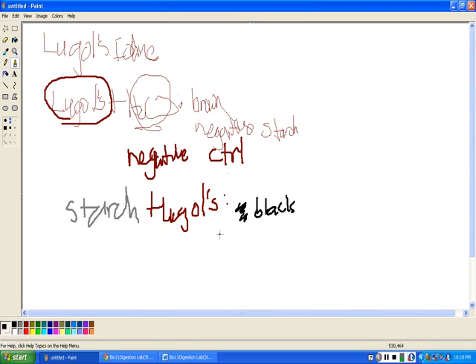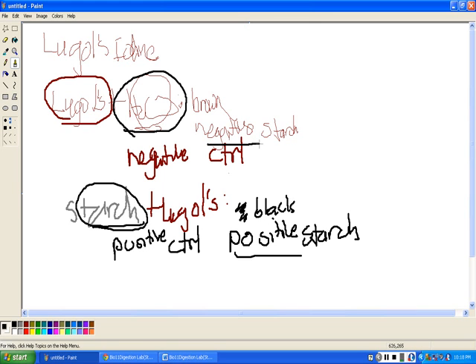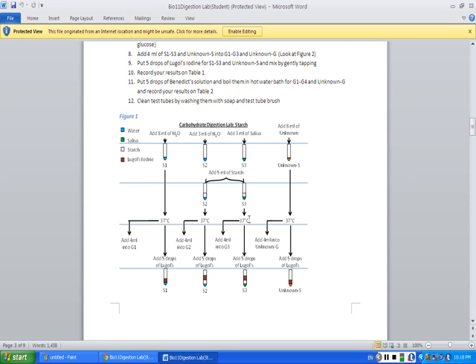So it's black. That means it is a positive reaction, or positive for starch. Of course, it makes sense because we're actually adding starch in this particular case. So this is another control, our positive control, because we're purposely adding starch to give us a positive result, while we're purposely adding just water to give us a negative result, and that's why this was a negative control over here.